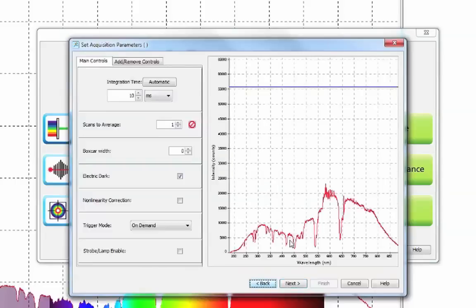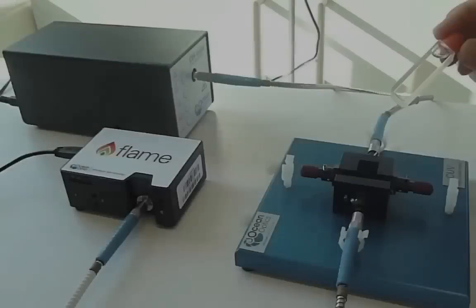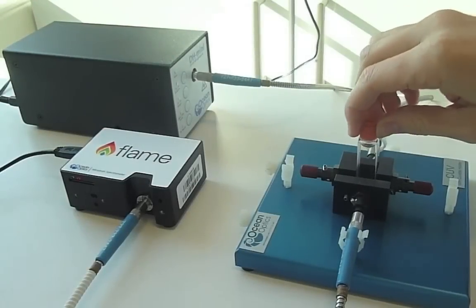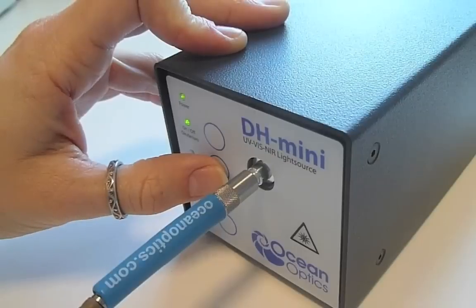Next you will be asked to set the parameters for your measurement. You will need to choose your integration time. To pick a suitable integration time, put your sample in the cuvette holder and switch on your light source.